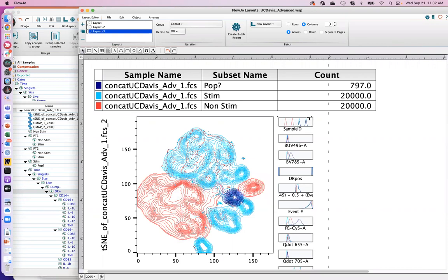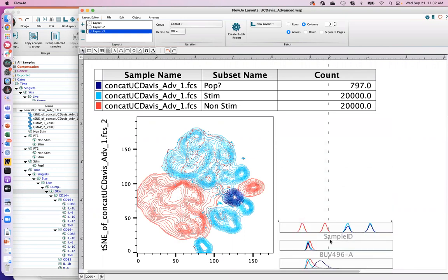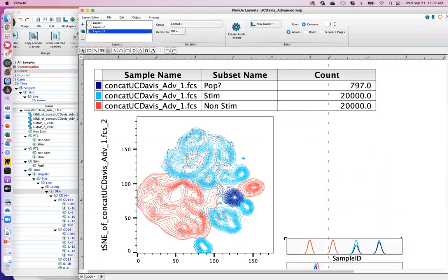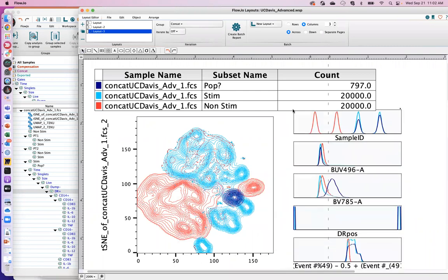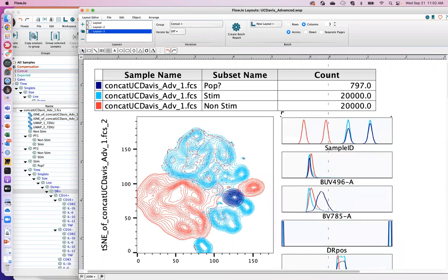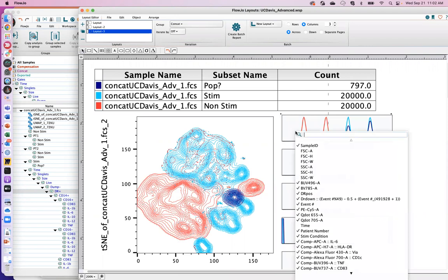Okay, and then the histogram panel will appear and you'll have to stretch this guy out quite a few times in order to get it to be nice and easily visible. So I like it kind of tall but slightly narrow. But it's really a matter of personal taste. Okay, so we get it big enough here so you guys can see.